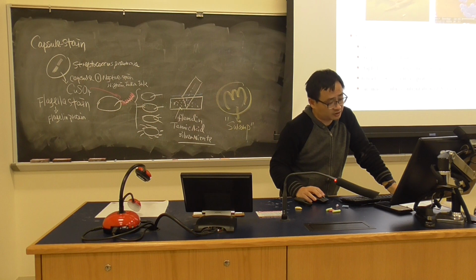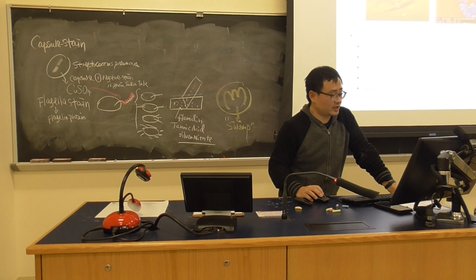Neisseria is gram-negative diplococci. Streptococcus looks like a chain. Staphylococcus is grape-like. This is Staphylococcus aureus. Everybody knows this is Streptococcus agalactiae. We will talk about that. Pregnant women at 35 weeks have to do a screening test because otherwise it can cause newborn babies pneumonia and meningitis.